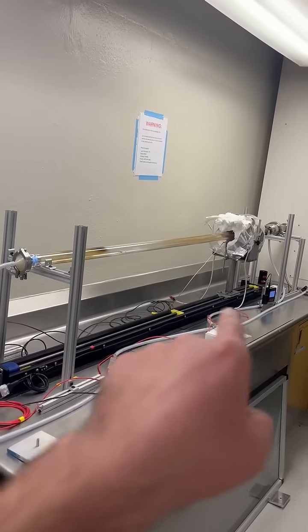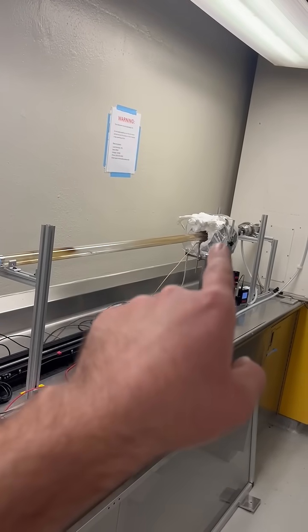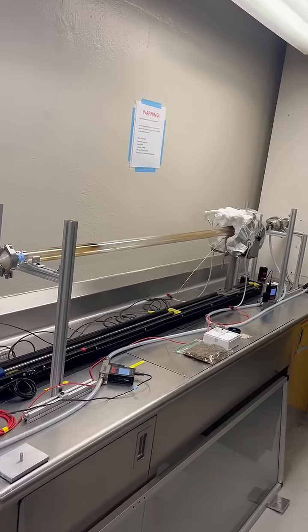This right here is a linear actuator and it moves the ring furnace, which is here, down this quartz tube.